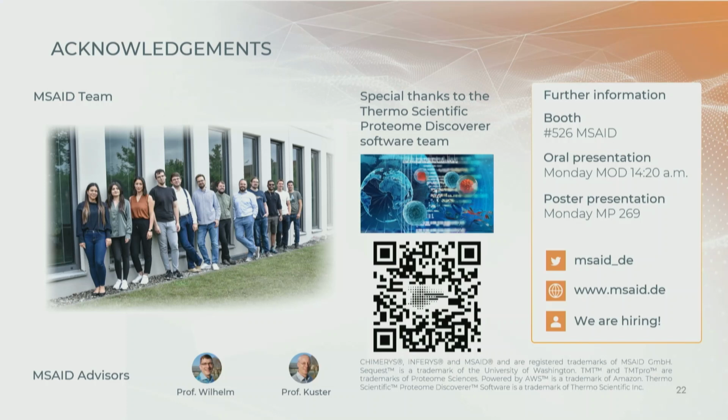Mm-hmm. So maybe to your first question, we didn't do an analysis quantifying how many shared fragments we have across how many peptides and to which proteins they map. But what is of course clear is that fragments of lower mass have a much higher likelihood of being shared. But that's certainly a very interesting analysis to do. To your second question with respect to parsimony, protein grouping at the moment is performed by Proteome Discoverer in a parsimonious way. So that, of course, doesn't apply to the peptide identification approach here, which is technically not parsimonious in that sense.